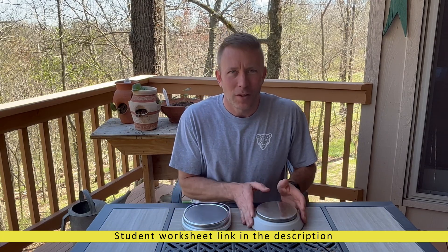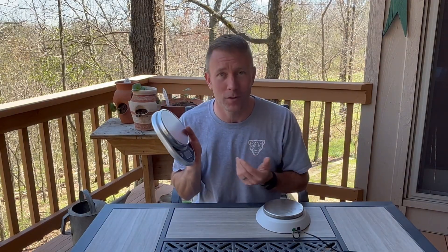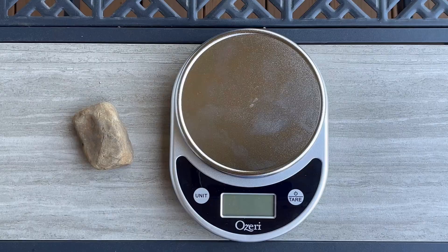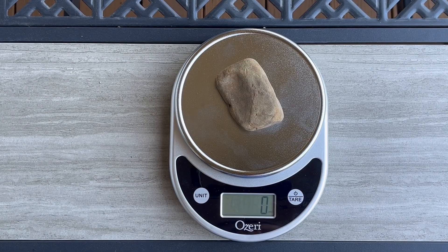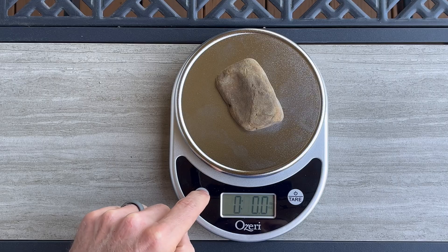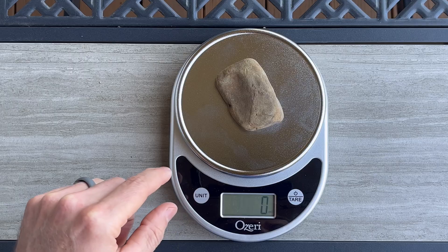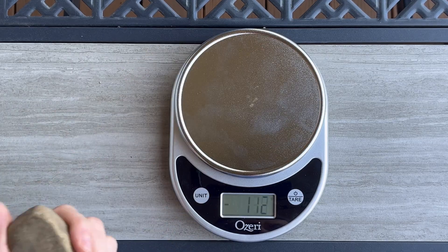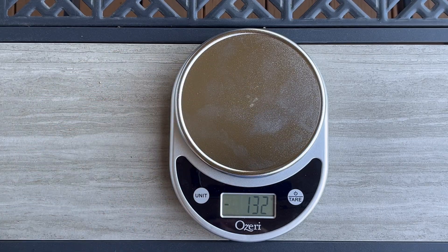Today we're going to have a quick tutorial on how to use a digital scale. You're probably thinking, come on, there are two buttons — do we really need a tutorial? Well, if you're anything like me, you might. Put something on it, turn it on, and you get zero. Maybe this button does something — g, lb, lb oz, kg, oz — what do these all mean? Now it's negative. This thing must be broken.